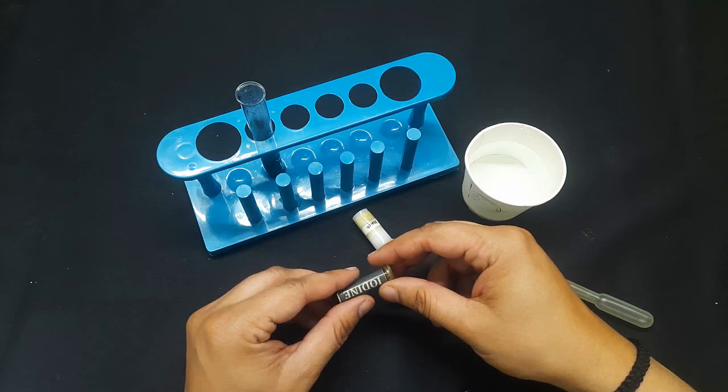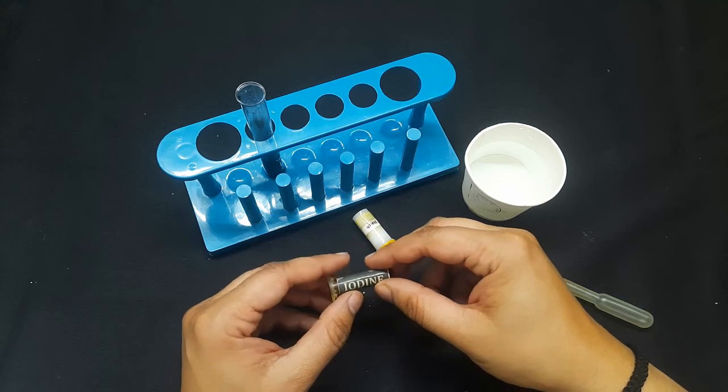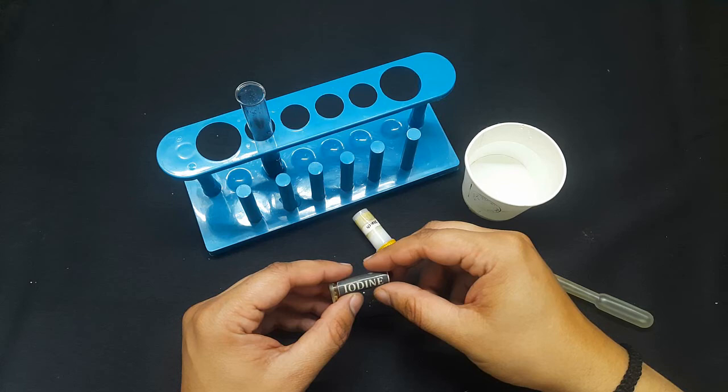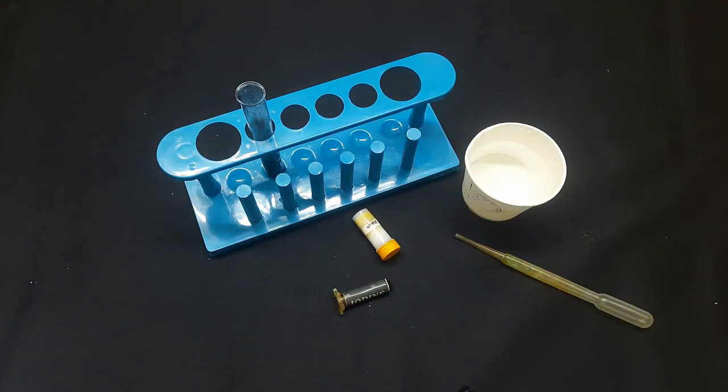In the same way, you can check the presence of starch in wheat. You have it easily available in your home. You can check the starch on apple, banana, boiled rice. So in this way, you can check the presence of starch in different foods present in your home. So this is all about the test for the presence of starch in food, or you can also call it an iodine test. Let me repeat all the steps once again.